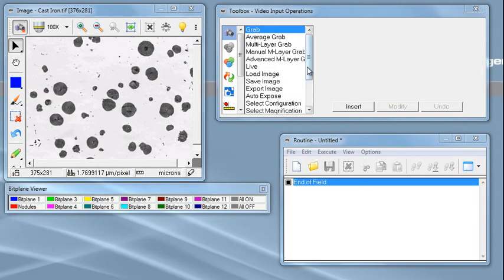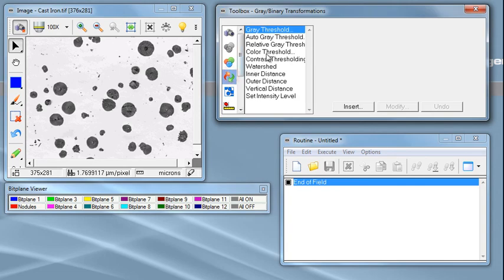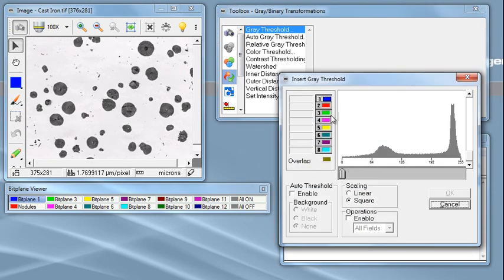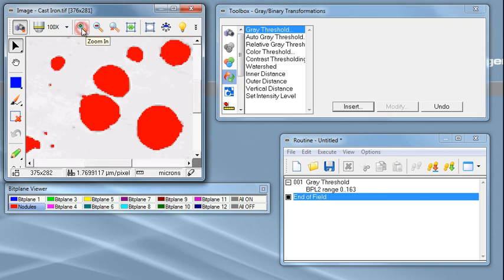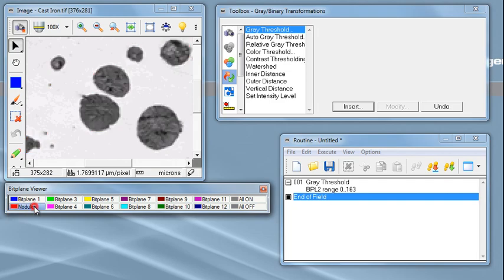Binarizing an image, or in other words creating a binary plane to represent those features you want to measure, is only the first step in image analysis. A typical routine will have steps to fine-tune this binary layer and then to measure it. All you have to know at this stage is that this binary plane exists. Also be aware that this is a separate layer which can be turned on and off to compare it to the original image underneath.